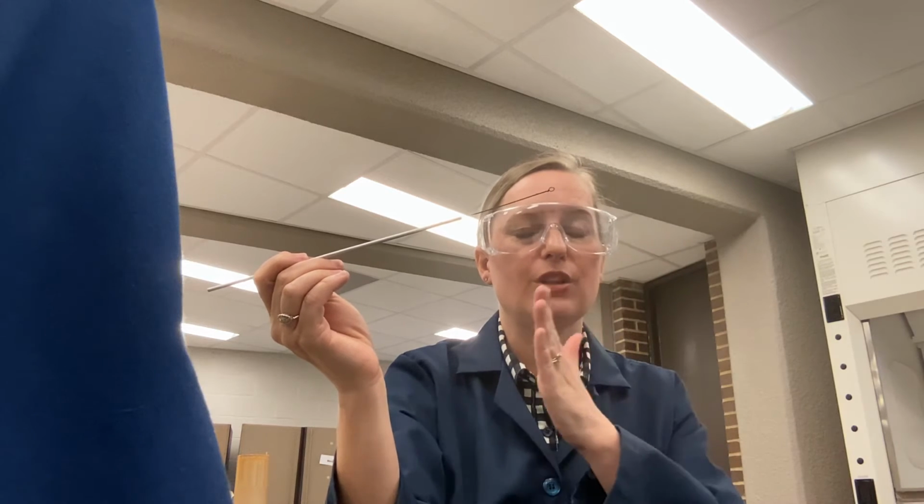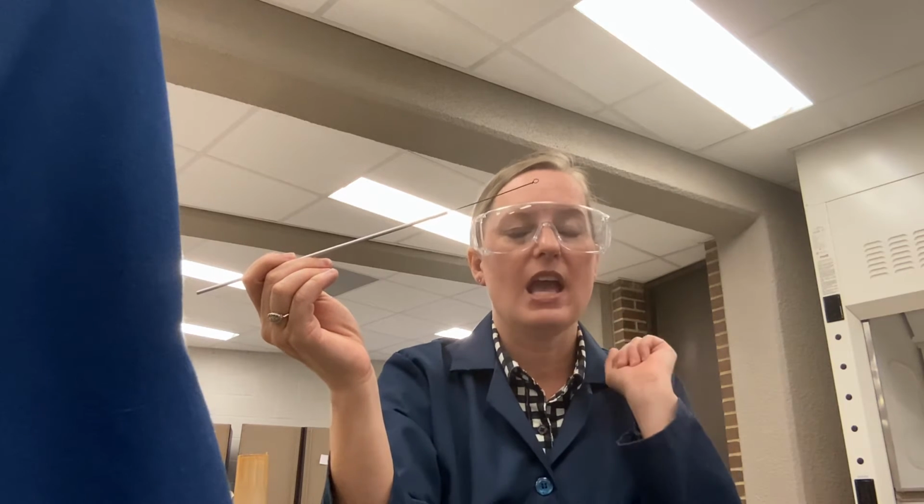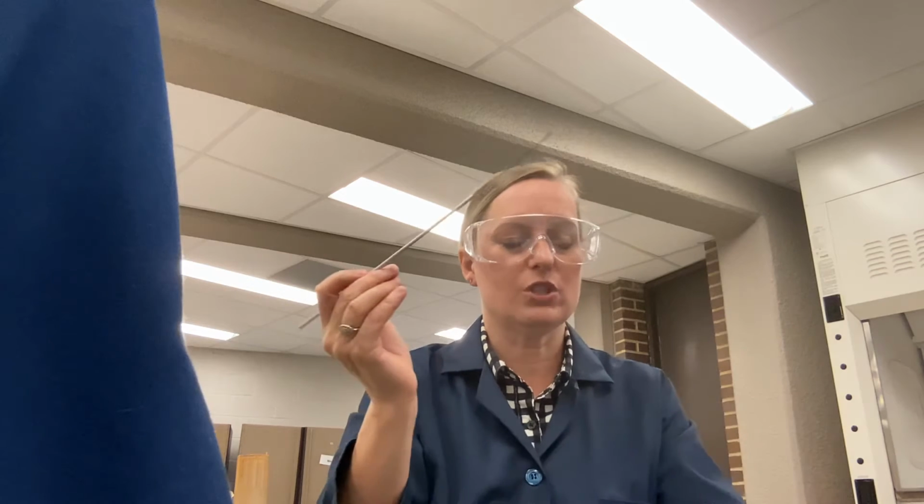So things to think about as you're going through each of these zones, which is zone 1 through 4, because it's called the quadrant streak method. Are you overlapping zones 1 and 2, 2 and 3, 3 and 4, so that you are dragging from each section? But you do not want to overlap 4 and 1, because 1 should have the most colonies after incubation, and 4 should have the least amount of colonies. So 1 should have tons, because that's where it was the least dilute, and 4 should have just individual colonies, which is what we're looking for.